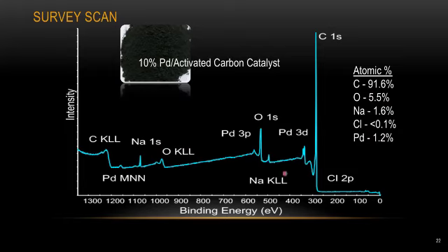The data you're seeing on the screen actually depends on a few factors. There are three main factors affecting the data you receive. The first factor is the photoionization cross-section, the second is the surface sensitivity, and the last is the final state effect. Now we'll go through each factor so you will know why you receive this kind of data from your sample.